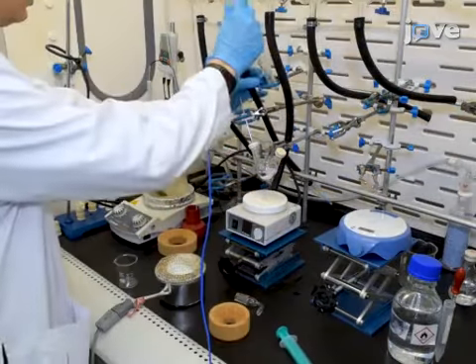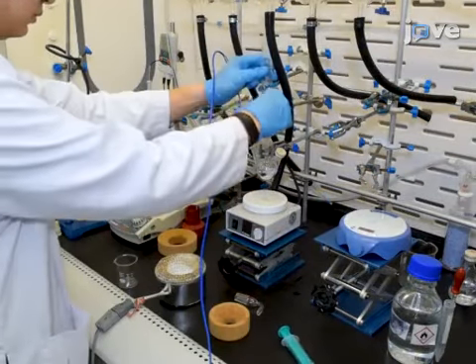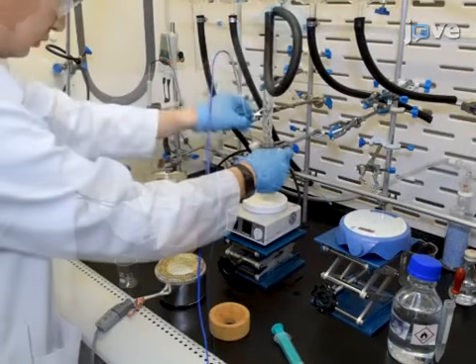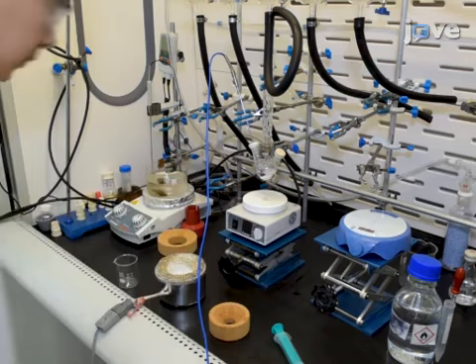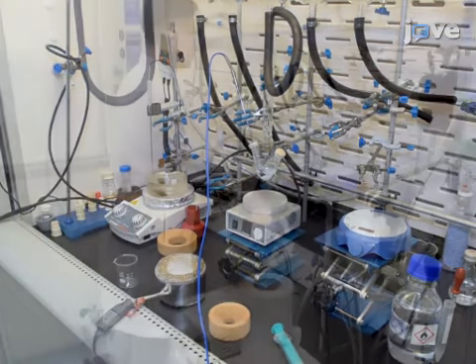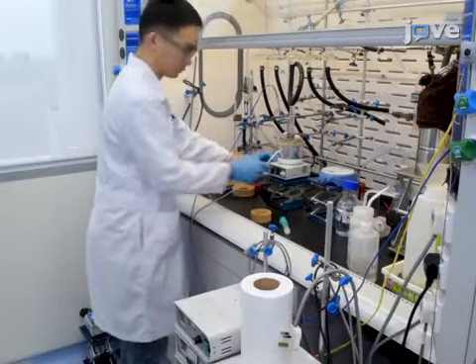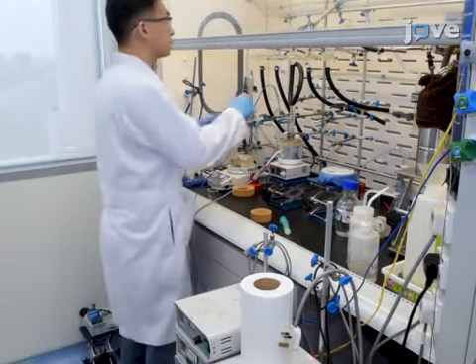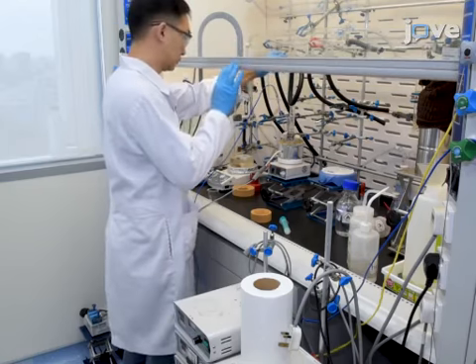Mount a reflux condenser on the round bottom flask and connect it to a Schlenk line via an adapter. Then, seal the remaining port with a rubber septum. After applying high vacuum grease on all glass-to-glass joints, heat the stirring mixture to 150 degrees Celsius and place it under a vacuum for 1.5 hours to degas.